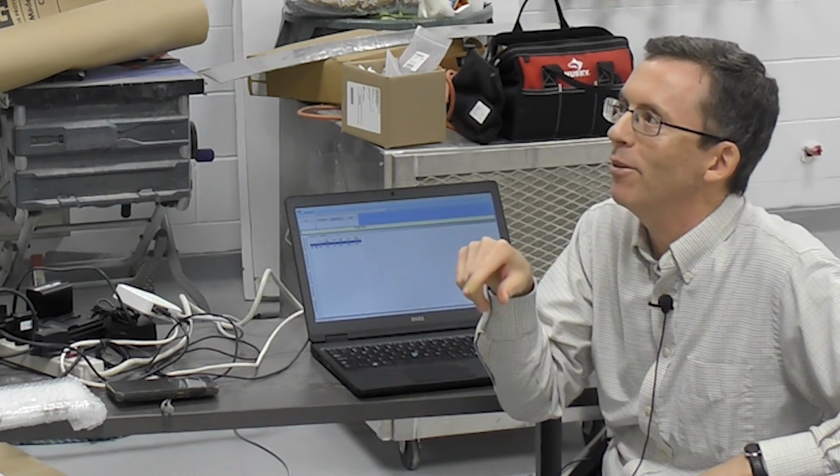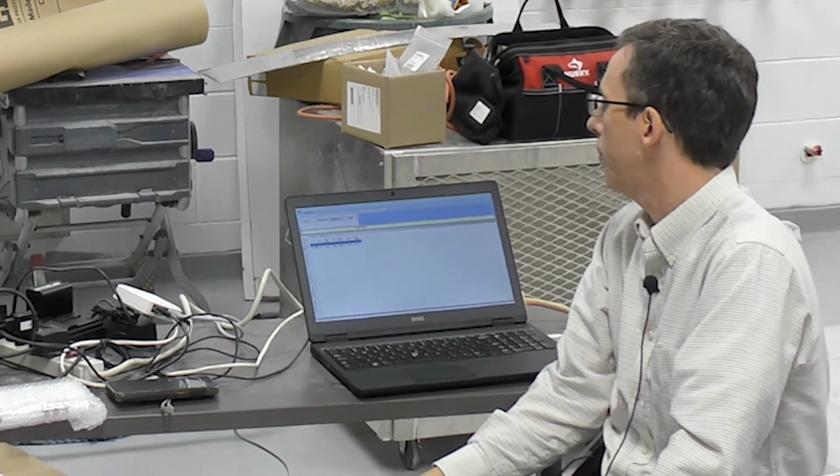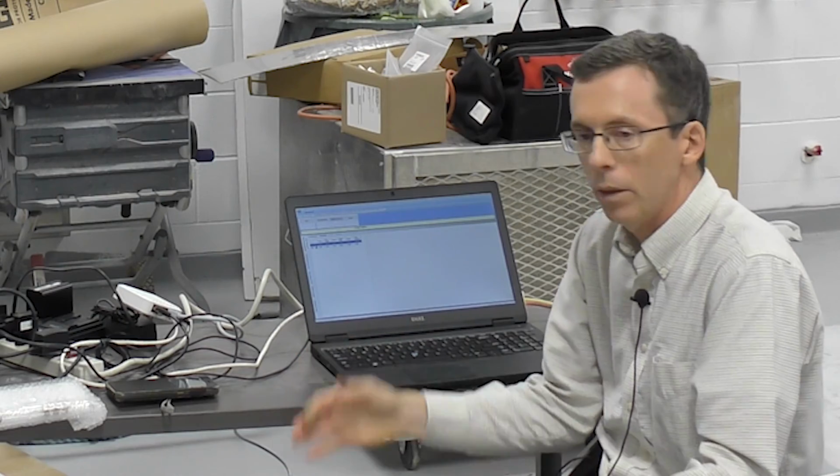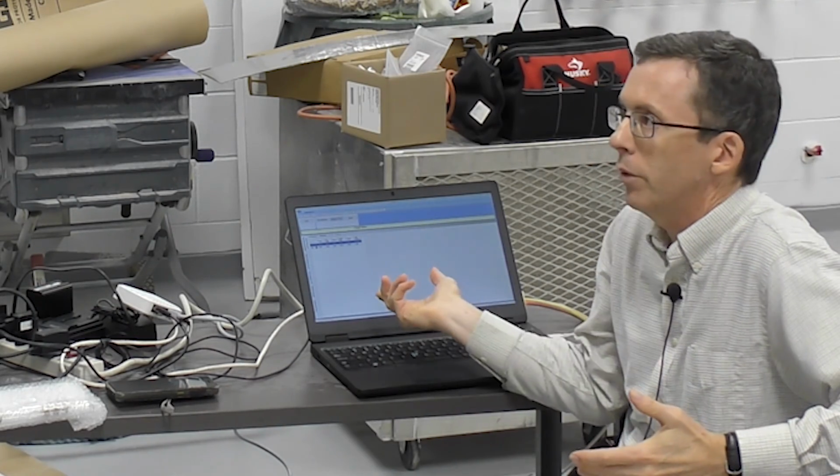And then the nice thing is, if you're going to do a replicate, everything is stored. So all you do is just change the name of the file. It's all set up, and it even has the same name, and you just change the 01 to a 02 and say, I want to run the same thing, and that's it. So you don't have to do all that setup that I showed you. Okay? That's it. And then you just keep track by hand. I have a hand sheet that I keep track of the TID and I confirm. Okay?